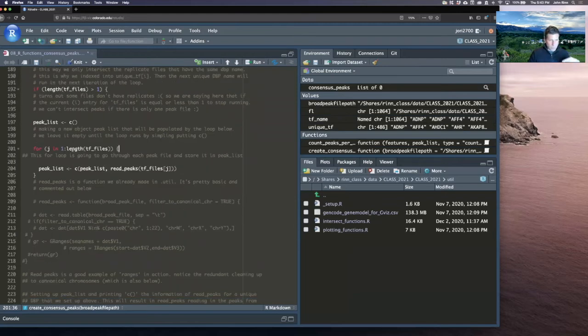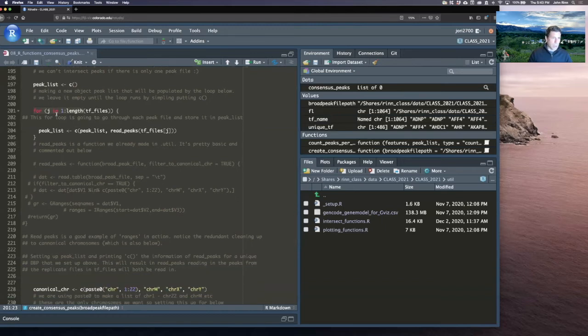We're still running the first for loop for I, and now we're going to do a second one, and we have to set a second variable, and we'll use J here. Okay, so for J in 1 through length of all the files again, so a very similar start to the first for loop, but using J now to index to do what we want between these two curly braces.